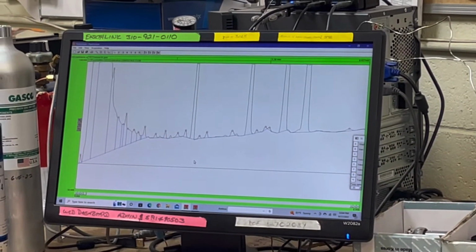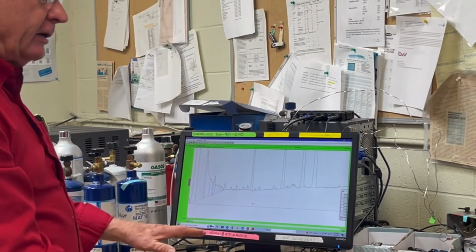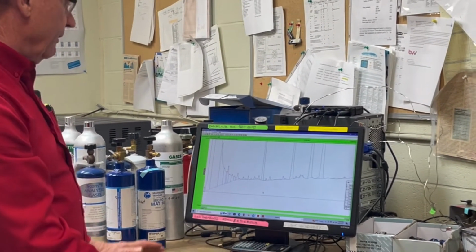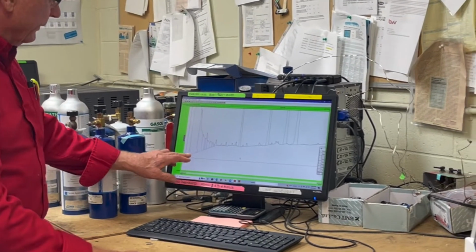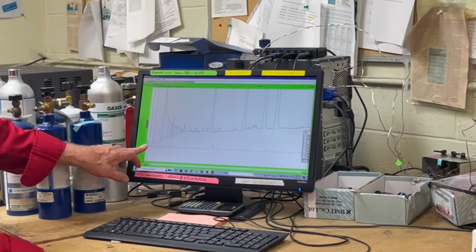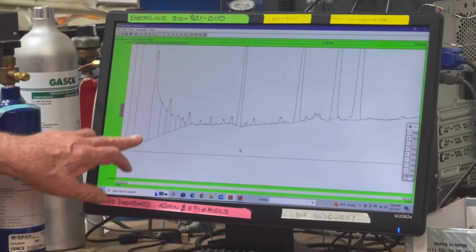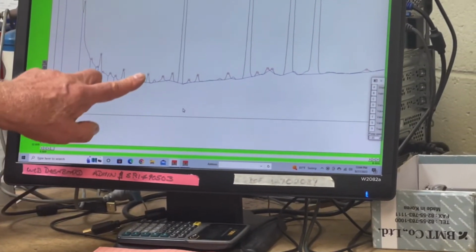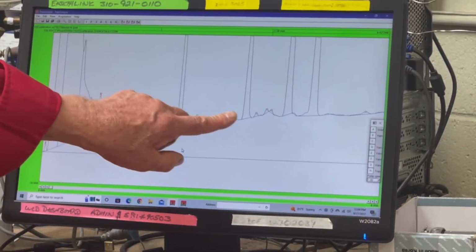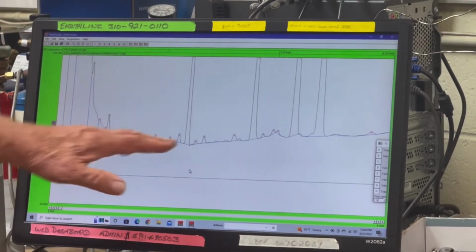And that would seem like a simple thing, but oftentimes it's not. So we've built into Peak Simple a number of tools that the operator can use to override or help the integration algorithm figure out where the true bottom of the peak is. One of the rules that the blue line has to follow is that it can never penetrate through the black line, right? So if the signal goes down, the blue line has to follow it down and then again figure out where to start establishing its new position relative to the data.